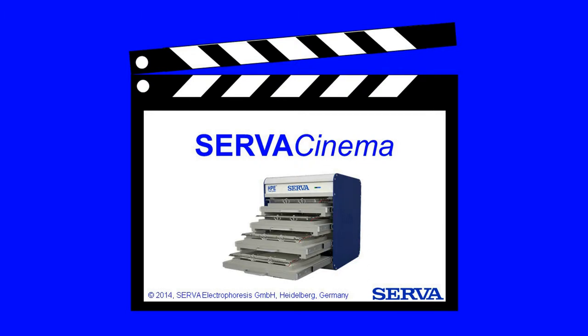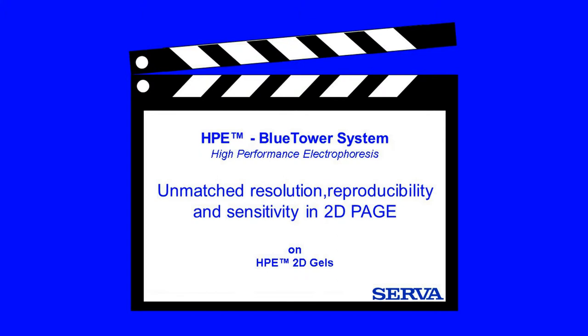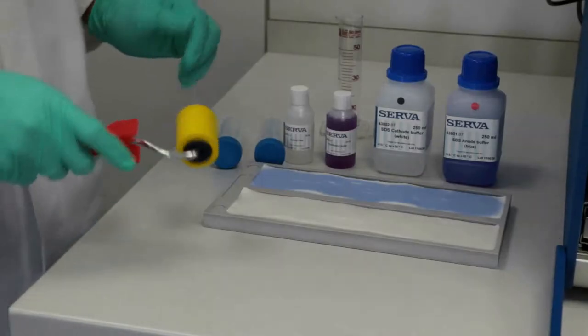Servacinema presents unmatched resolution, reproducibility and sensitivity using the HPE tower system and HPE 2D gels.